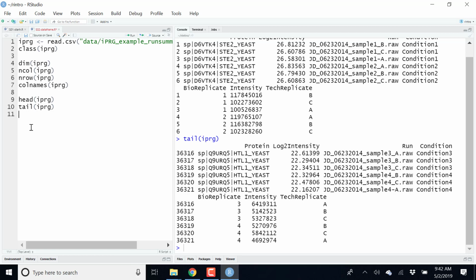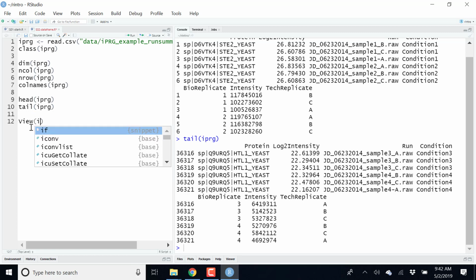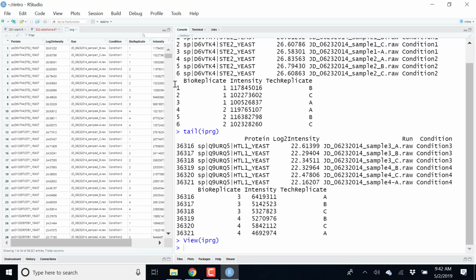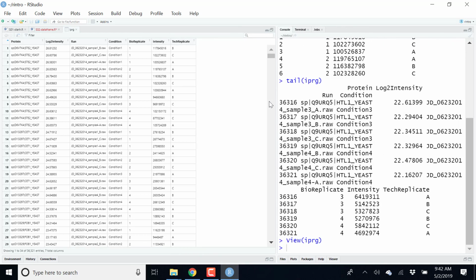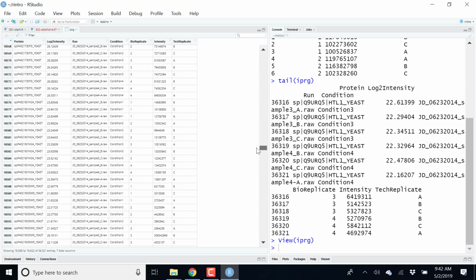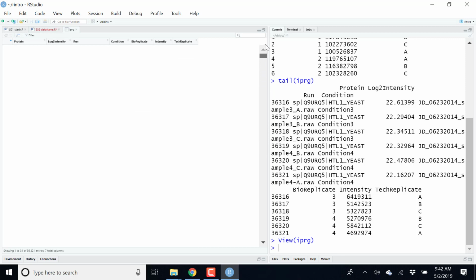There is actually, if we use RStudio, another very useful function that is View with a capital V, and that in RStudio will automatically fire up this spreadsheet editor, although you can't change it, but you can then also quickly visualize your data as you are used to interact.